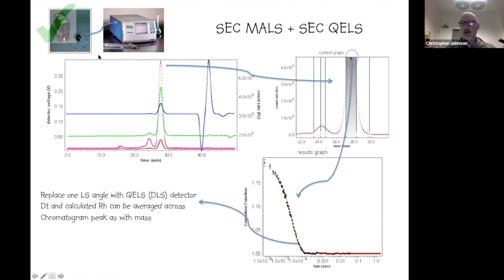So once again, it would be desirable if we could fractionate the material, and that's exactly what we can do. In the light scattering detector from Wyatt, one of the static light scattering detectors is removed and replaced with a dynamic light scattering detector that measures the fluctuations and does the autocorrelation. Because the material is fractionated, we get extremely clean autocorrelation functions and fairly well-determined hydrodynamic radii.